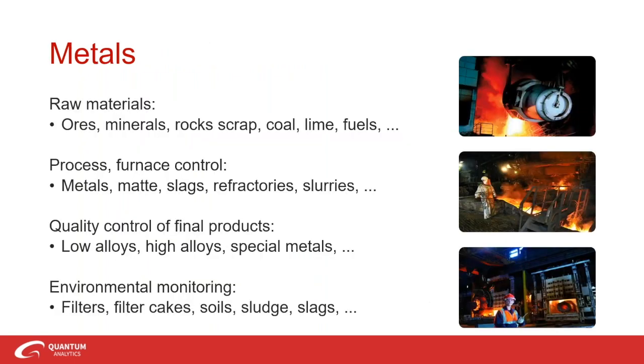So let's do a little deeper dive into just a few of these applications, and look at metals. XRF instrumentation is used to verify the quality and composition of metals used in fabrication to ensure that the final product has good integrity. This analysis prevents incorrect or out of specification metal alloys caused by material mix-ups, incorrect welding chemistry and dilution, or even counterfeit materials from entering a manufacturing process.